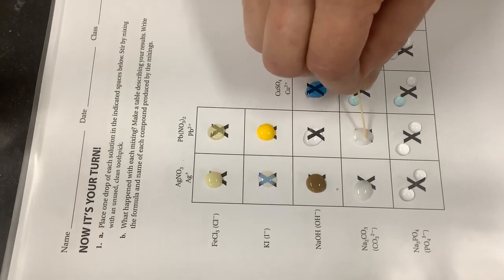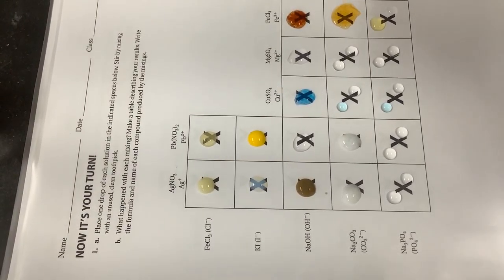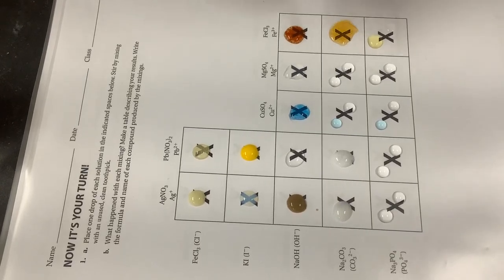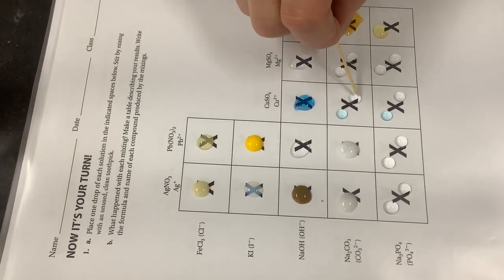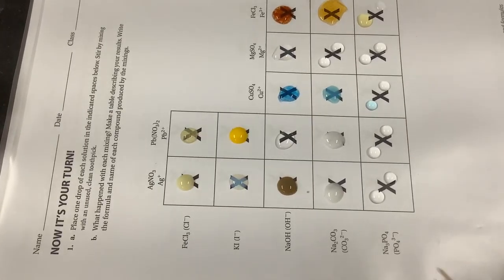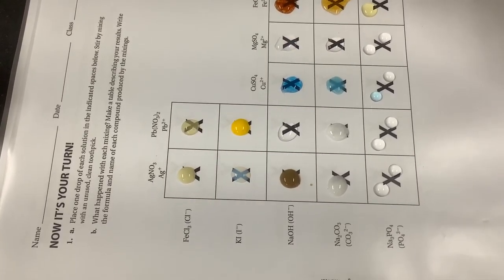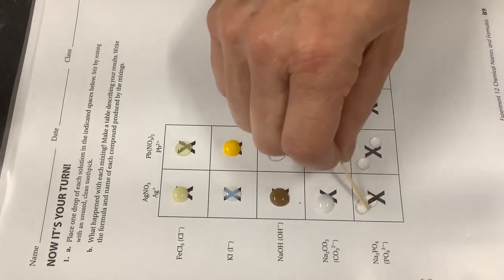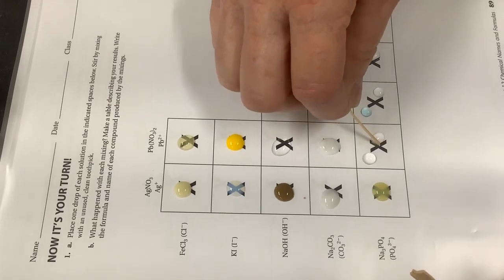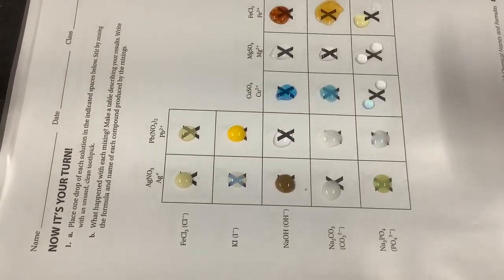Here's iron hydroxide — that beautiful rust color. Sodium carbonate with silver nitrate is going to make silver carbonate. And here should be a nice pretty white precipitate with our lead. Some of those lead paints had beautiful brilliant white pigments that made great paints, but unfortunately they were toxic so we don't use those pigments anymore. Here's copper sulfate with sodium carbonate — we're going to make copper carbonate. And magnesium sulfate with sodium carbonate is going to make magnesium carbonate.